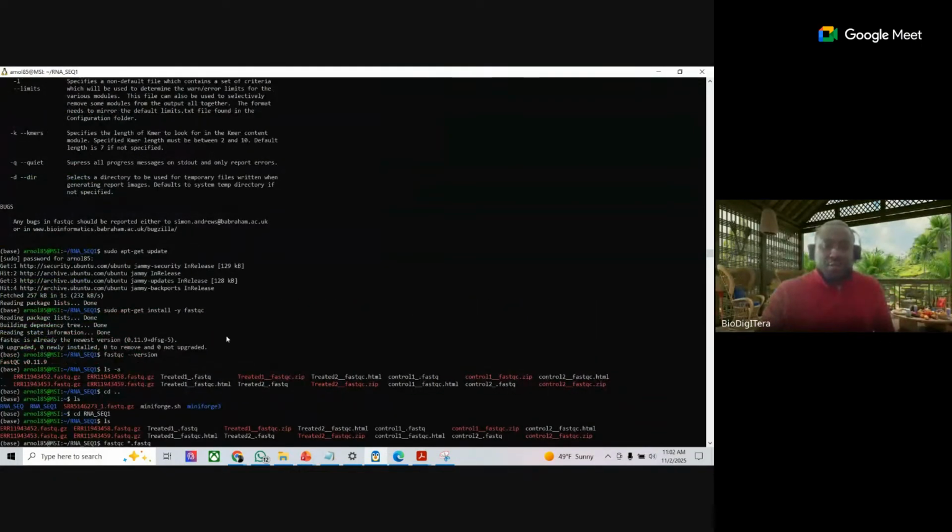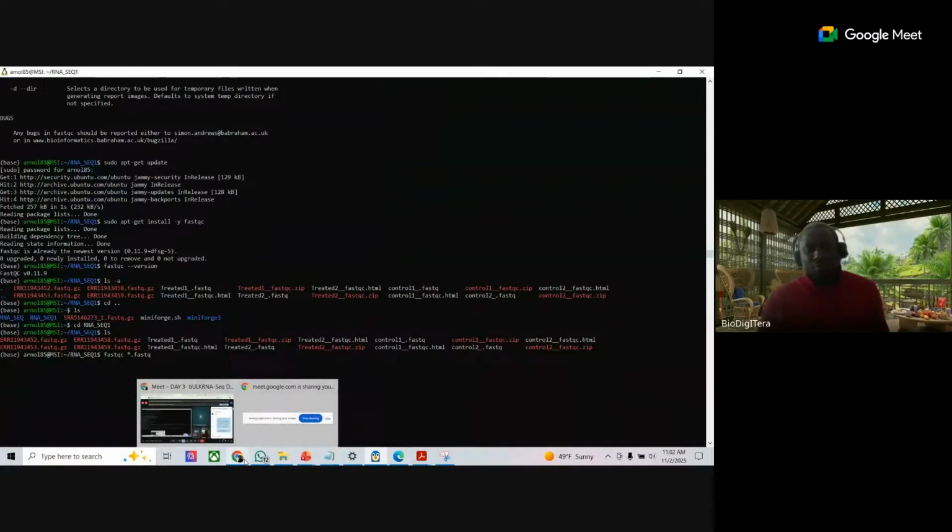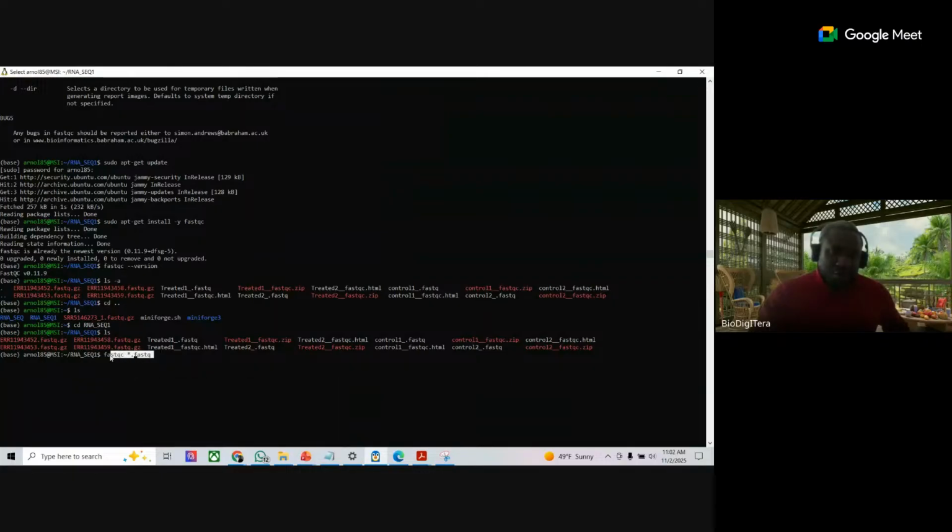There are two ways to do it. I am giving you the longest way first, because you don't have experience with Linux yet.